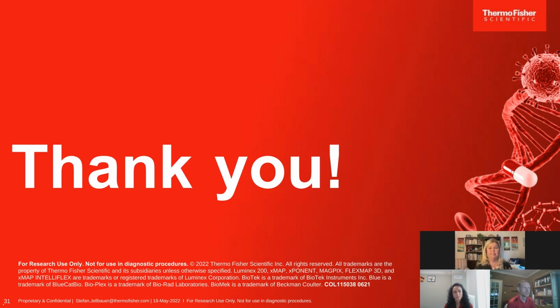Yeah, I can take that one as well. It's still QuantiGene Plex related. So while certainly our lab automation group could help you with setting up the sample prep in terms of the steps and automating the steps for lysis, incubation, and then eventually the RNA extraction if necessary, the sample prep procedure for QuantiGene Plex in general is very straightforward.